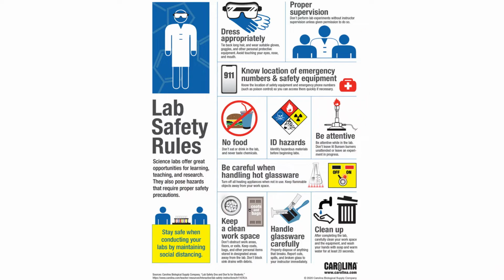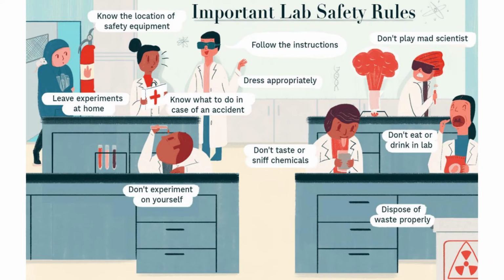Next is be careful when handling hot glassware. So you might accidentally spill something and break any glassware inside the laboratory. Keep a clean workspace. Medical technologists are known to be very OC, so we have to clean our area at all times. Handle glassware carefully and always clean up. Dispose of your waste, your trash, and at the same time, practice proper hand hygiene. These are the same important laboratory safety rules that I have discussed prior to this.